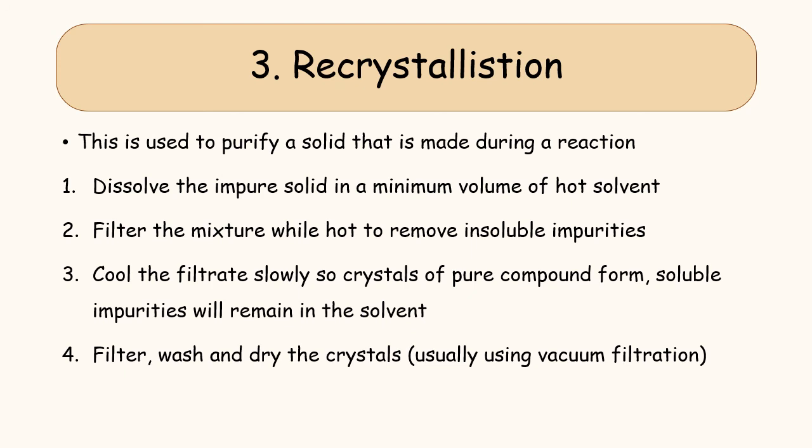and your compound will slowly form crystals. It might not look like crystals, but we call it crystallization. They will start to form, but you'll still have some solvent left behind, and anything that's not your compound, that's not pure, will remain in that solvent, your soluble impurities.